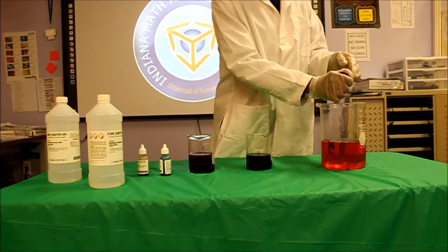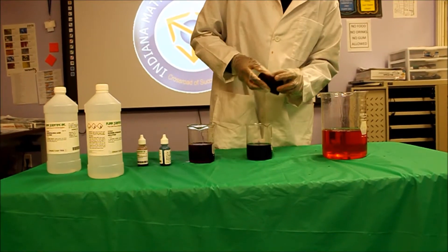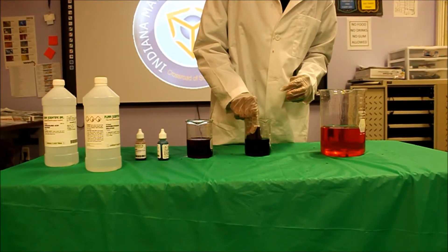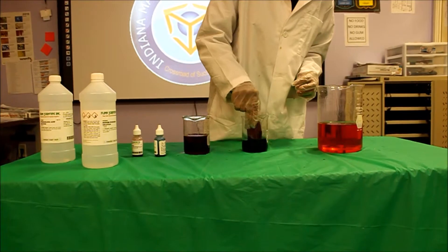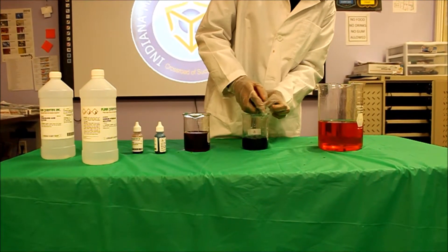So I'm going to dip it inside the blue solution to see what happens. And it turned back red.